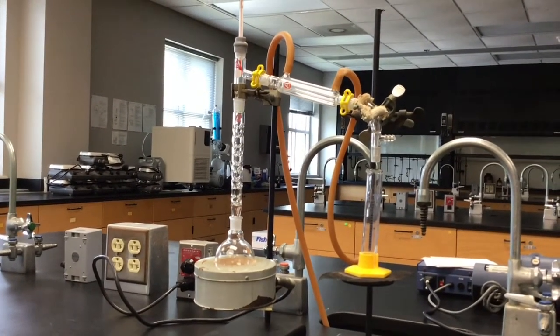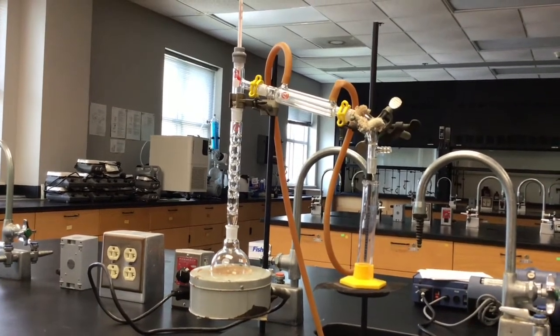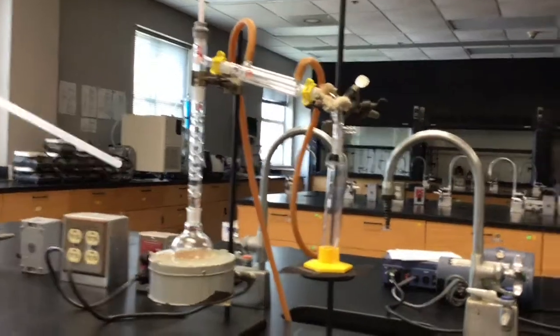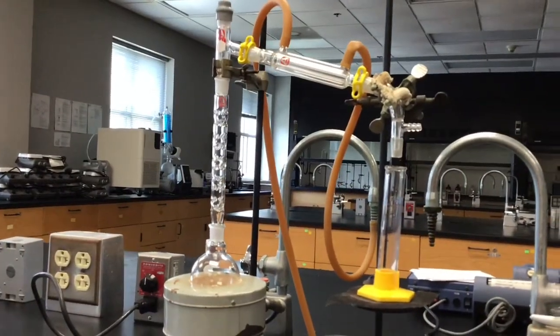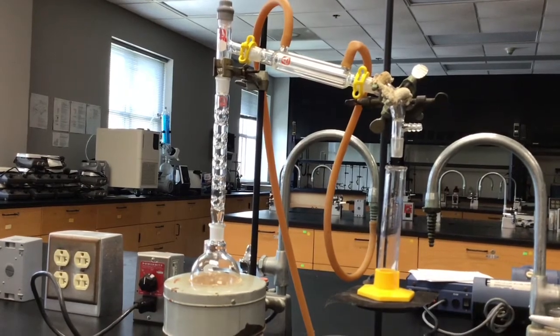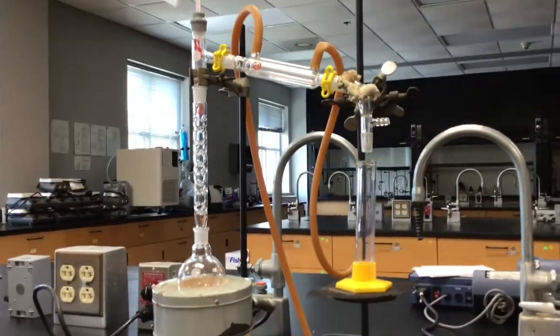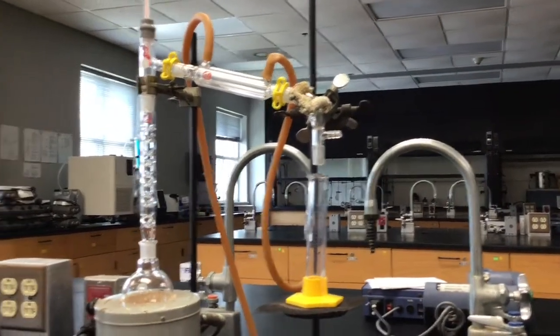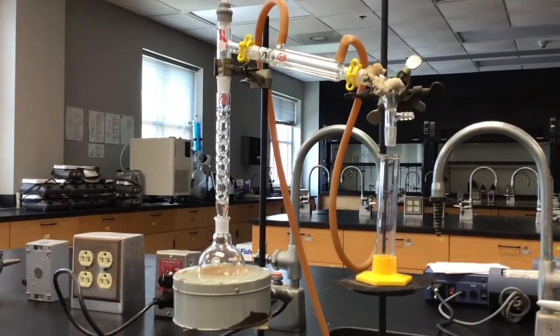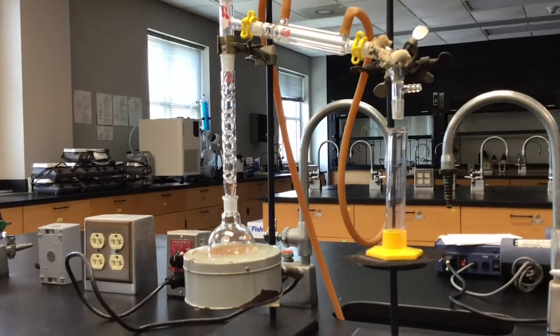So just going from left to right, first and foremost whenever you do a distillation you need to make sure that you always have a vent to the atmosphere, which what I mean is there's got to be a hole somewhere in the apparatus for the air to get out because when you heat something up it'll expand and then you'll build pressure if you don't have a way to let the pressure go. In this case all of this is contained but there's a hole right here where the distillate comes out, and so you have a hole in the apparatus. You have to make sure you have a hole somewhere otherwise you're creating a bomb because that's what you're doing, you're building pressure until it explodes.